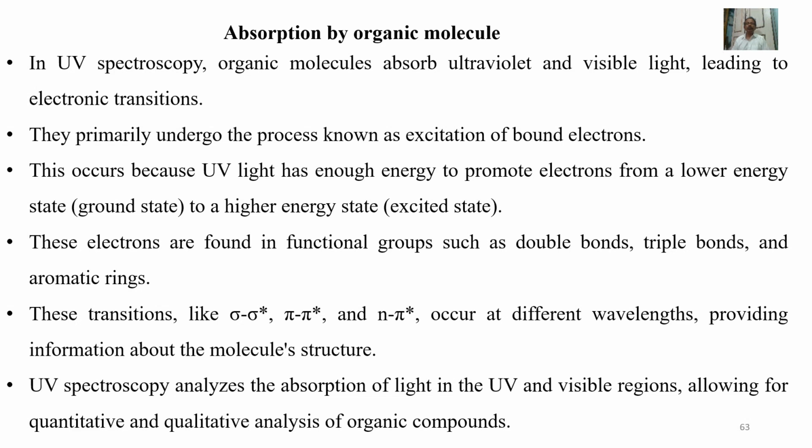We shall discuss absorption by organic molecules. UV absorption spectroscopy can be used for the quantitative determination of compounds which absorb UV radiation.